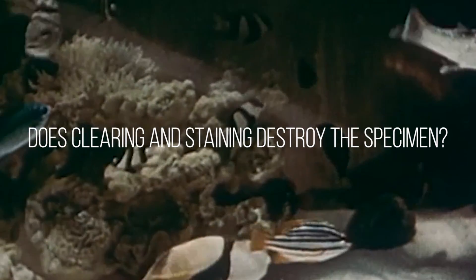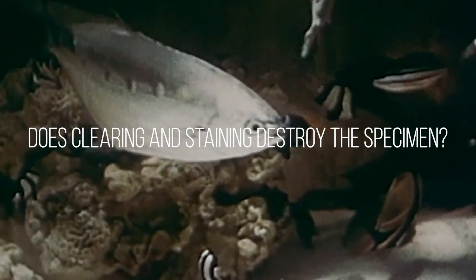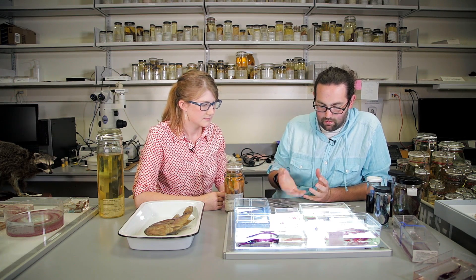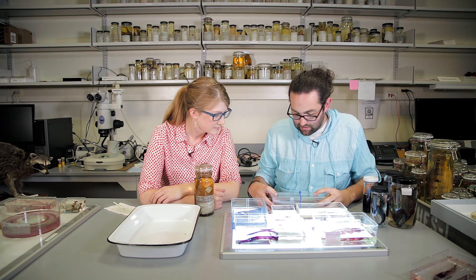Does this process destroy the specimen at all? Because it looks like it's kind of invasive. It doesn't destroy it — it changes the form of the specimen. Instead of looking like a preserved fish in a jar, it's now a different appearance and you can answer different questions with it. Sometimes the characteristics of the skeleton — not external anatomy or morphology — tell us what species it is.